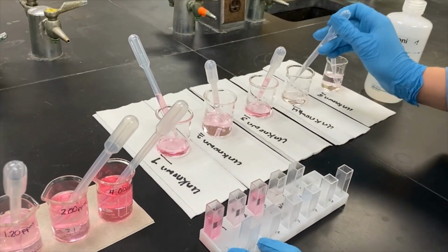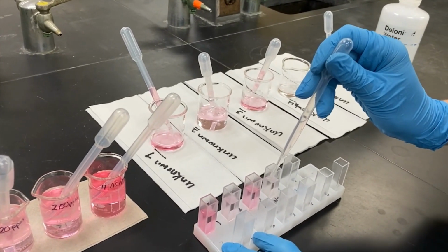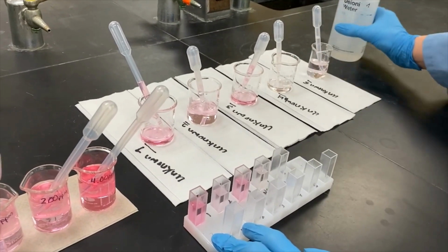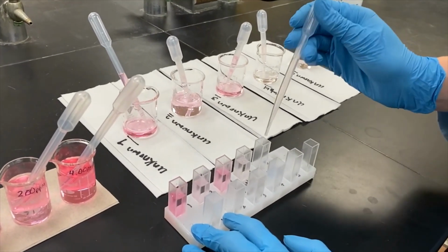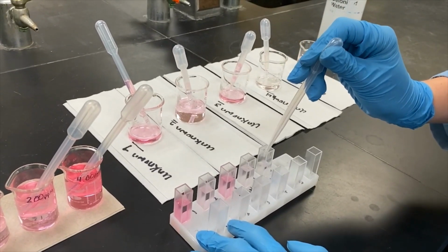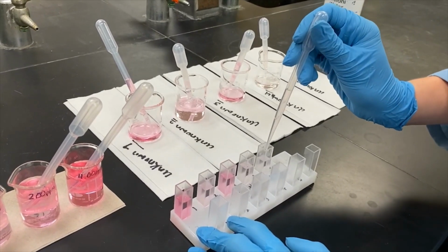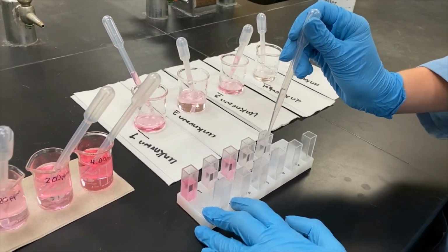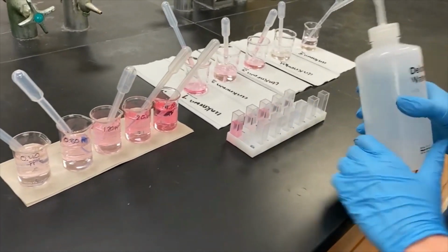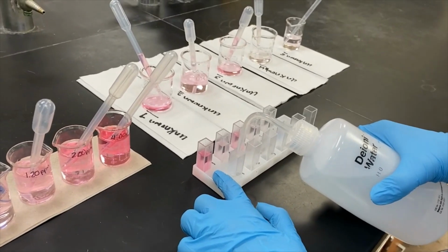We generally don't want to write on the cuvettes because like you saw with the different scratches, it gets in the way of the reading and it just makes it harder for reuse, because we do clean these out. Next, I'm going to fill a blank. This is also the blank you would have used to calibrate your machine.